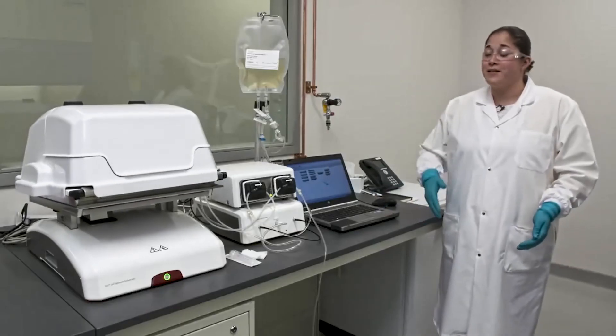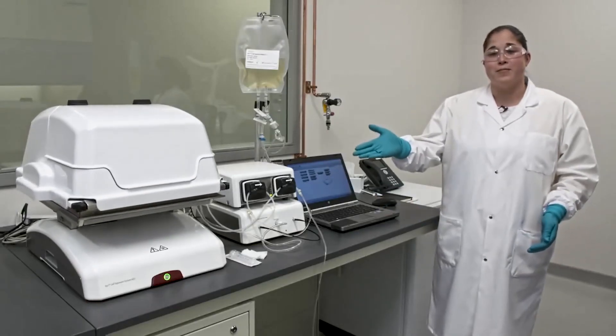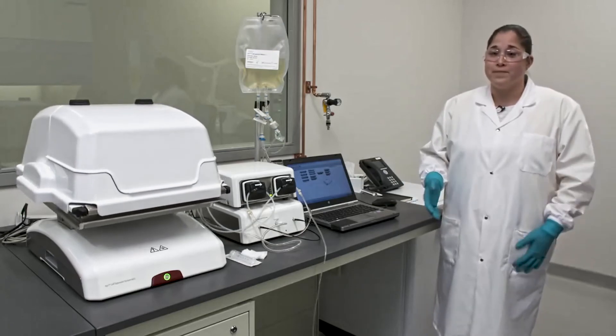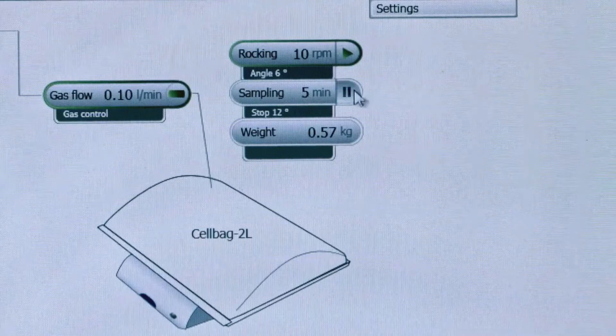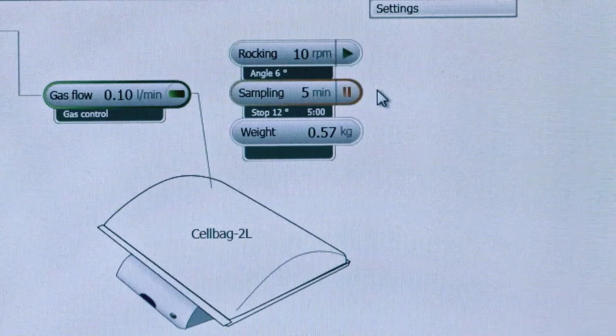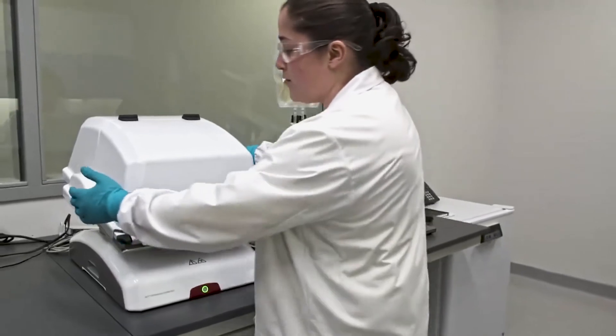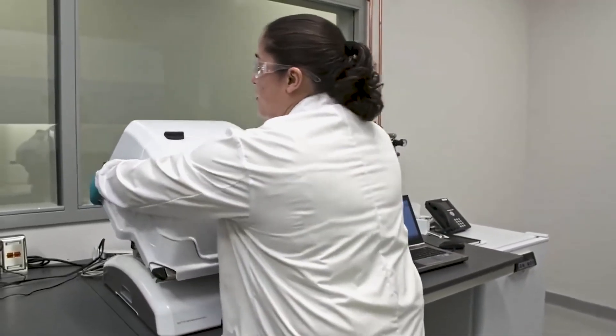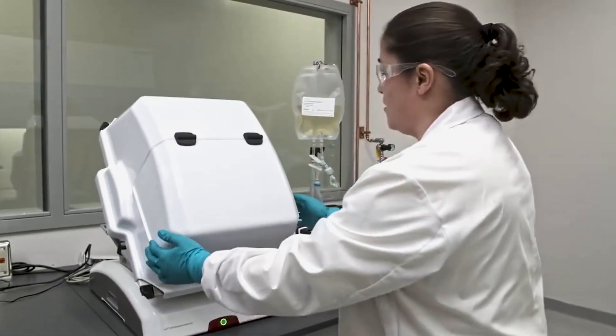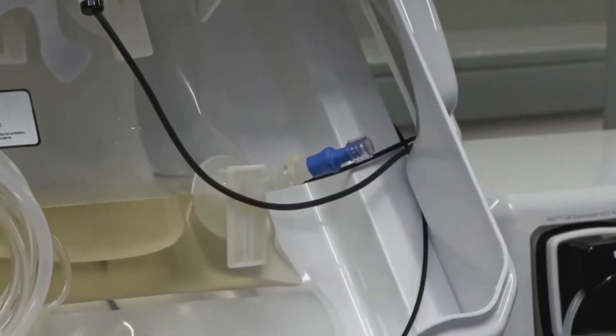During your cell culture process, after you've added your cells into your cell bag, you'll want to sample that cell bag. The first part of that process is to click sampling on Unicorn. This will have the rocker stop rocking. You can then go over and grabbing on the top, you'll put the rocker into sampling position. You'll open the cover and you're going to sample from the clave port.